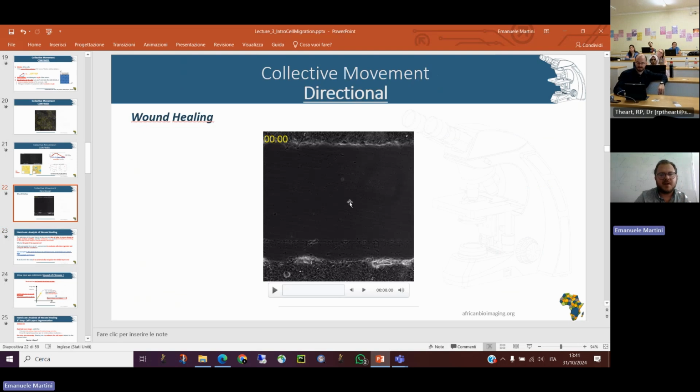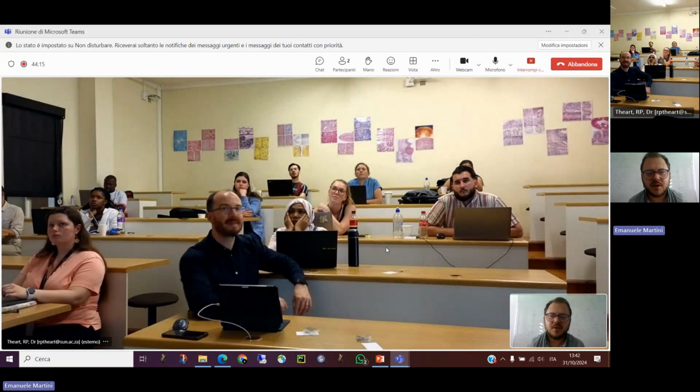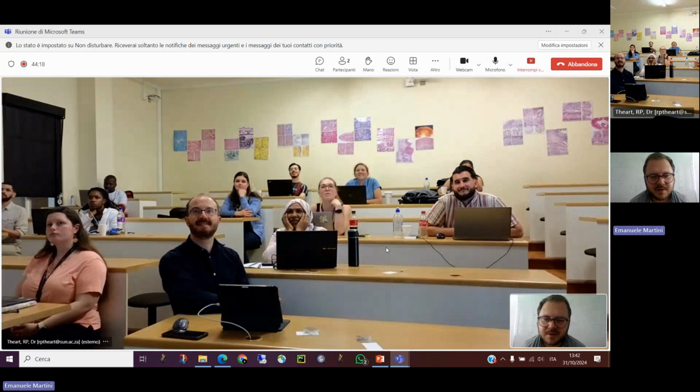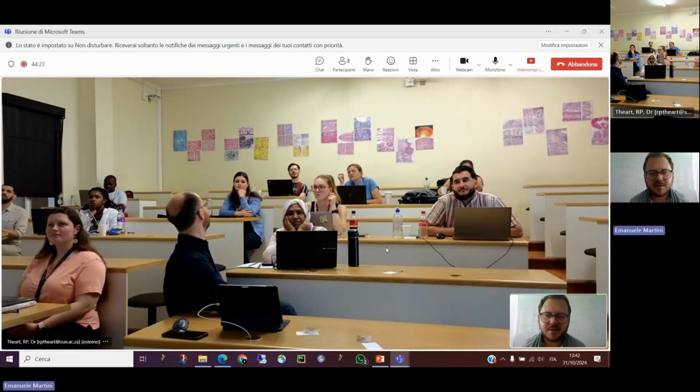How can you think to estimate the speed of closure of this experiment with the tools and the things you have learned in these days with Rensu? So what do you think can be a good parameter able to estimate the speed of closure of an experiment like this? If someone has some idea, just consider that I don't see the audience. Now I see the audience. Okay. If not, I can give it myself. Someone has some idea?